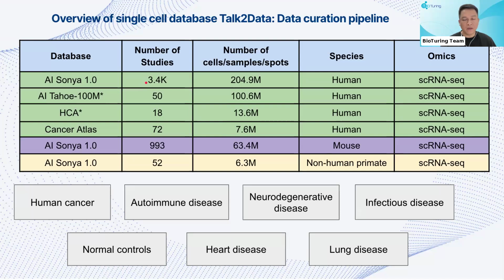by our team. And we will have a new version coming soon, which will include more and more single cell data for you to explore different diseases, and also increase the number of cells for particular types. Sometimes people would like to study cell types that are very rarely detected.